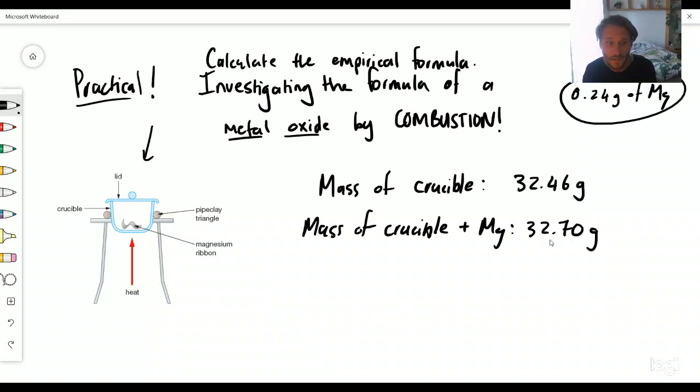Then you heat up this experiment, lifting the lid every so often, and you continue to heat. What's going to happen is that this magnesium is going to burn a bright white color. You keep burning until you lift the lid a few times and you can see that there's no more reaction taking place. There's no more bright white light - then you know your reaction is complete. Then what you do is you put your crucible that's just undergone this experiment and you weigh it.